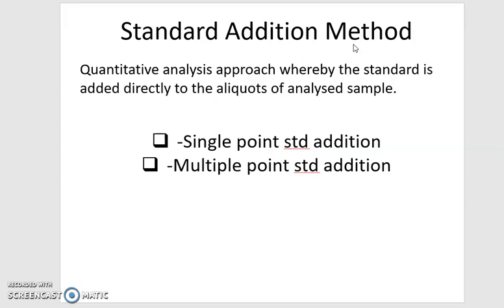The standard addition method can be conducted in two ways, either single point standard addition or multiple point standard addition.